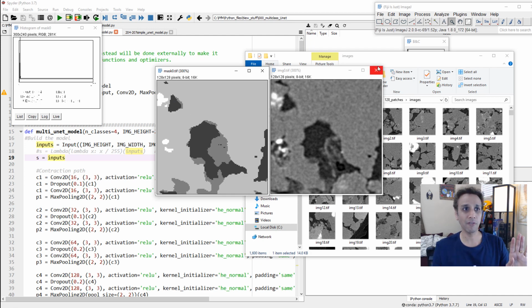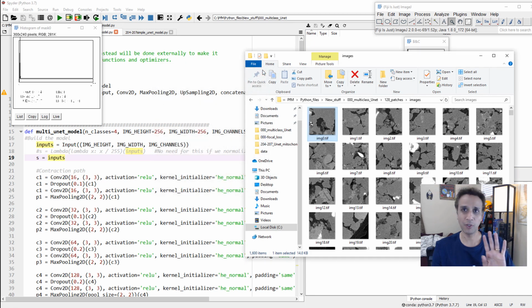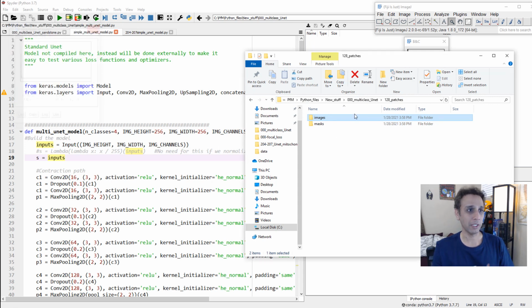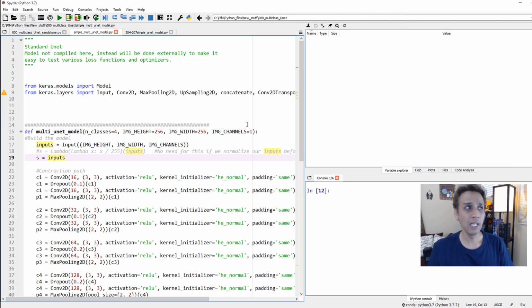And I have a whole bunch of images and a whole bunch of patches. Okay, so far 6 minutes into this, we haven't started anything, but we covered very important topics here. So this is my folder structure. Now let's get into the code.